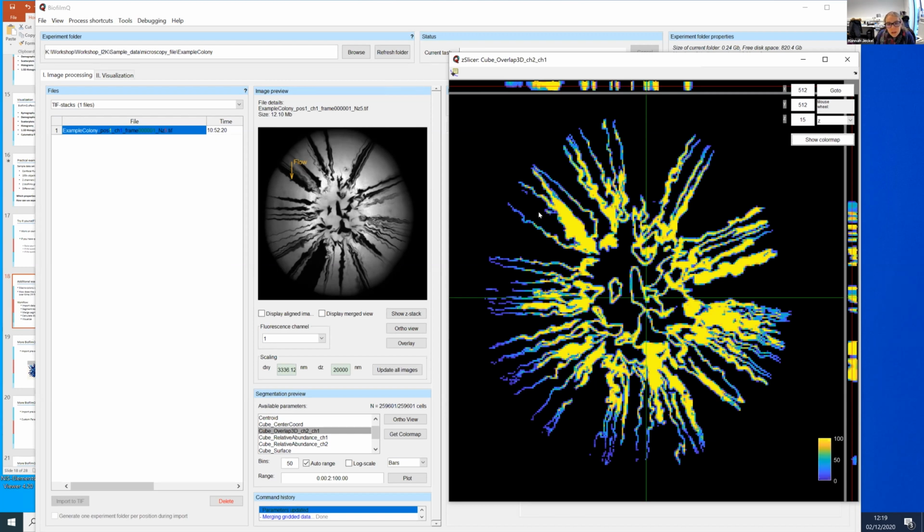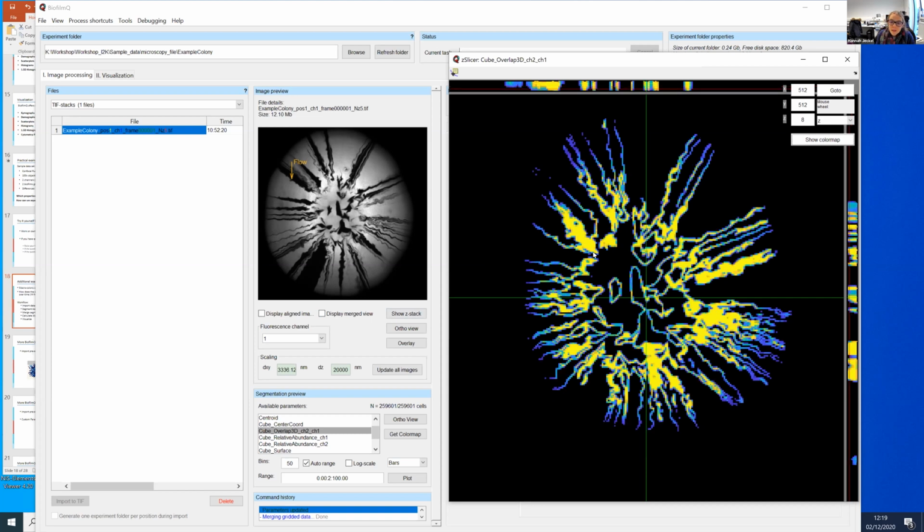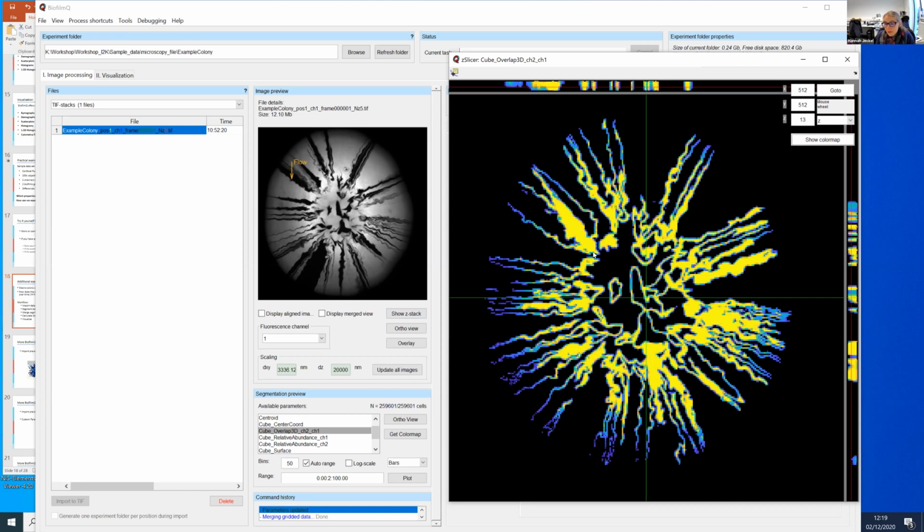But it's very interesting. Aside from these areas where we have them very closely intertwined, we also have some areas which are the borders between different areas of red or green cells. In general, if you were a perfectionist, you might want to go back and increase both of the thresholds of your segmentation to get a little bit less of this leakage, a little bit less of this overlap.